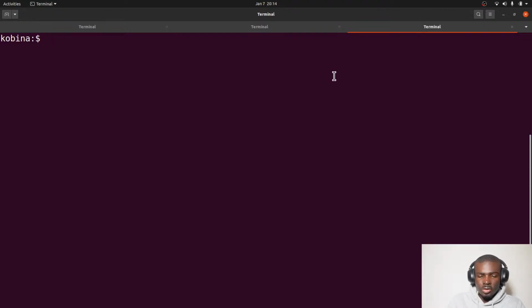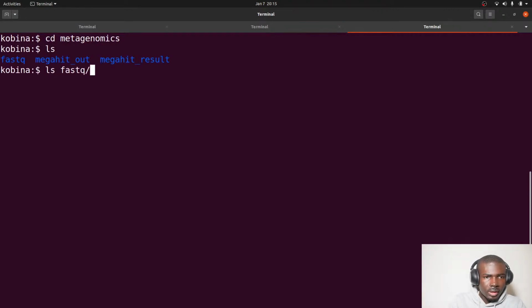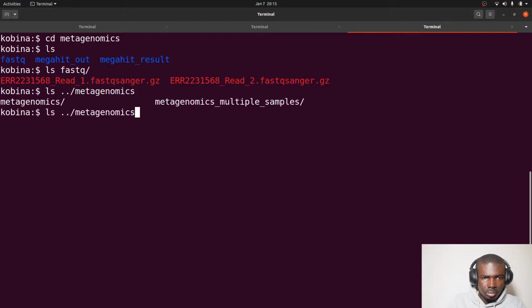Now if you have lots of samples, let me just do this. I think it's not this one. Let me just share that one here. It should be somewhere here. Let me check. I should have some FASTQ files here. Yeah, this one here, perfect.